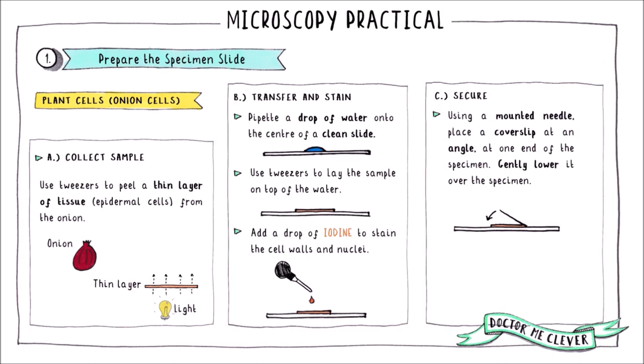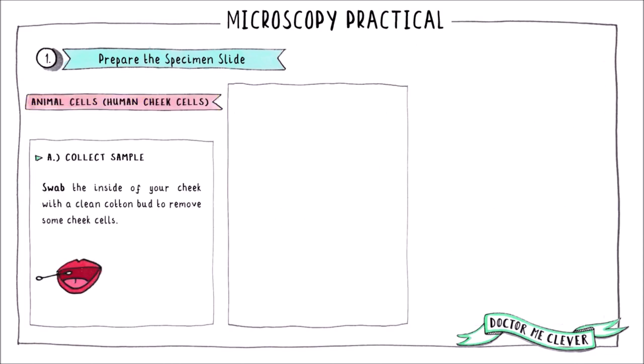Next, secure and protect your sample by using a mounting needle to lower a glass cover slip down over the onion cells. Finally, press down gently onto the cover slip to remove any air bubbles. Air bubbles look like big black spots down the microscope and can obstruct your view of the cells, so remove as many as you can.